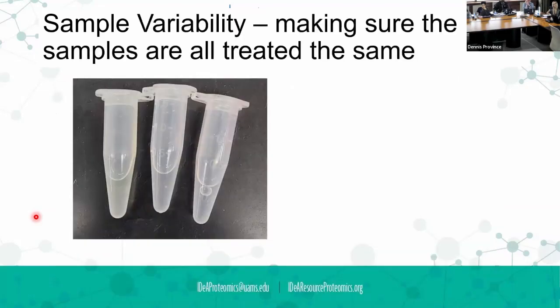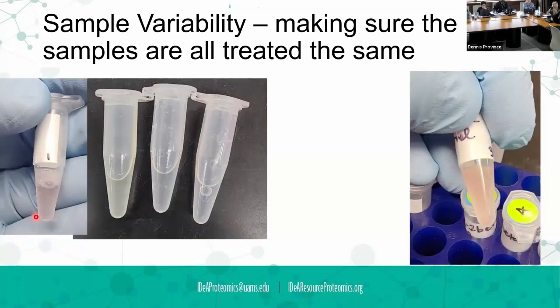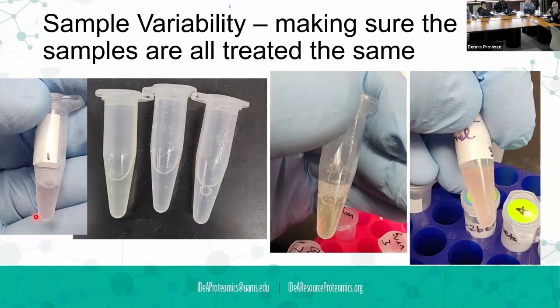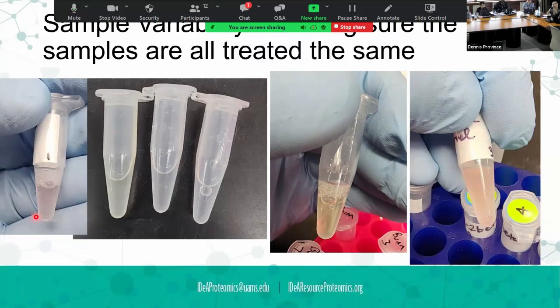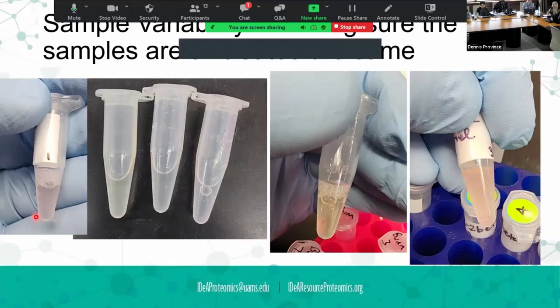Okay, we're almost done here, and then we're going to kick it over to Stephanie. So, sample variability. We want to make sure all the samples are treated the same. Now, Robert's got much better eyes than I do. When he looks at these up here, he looks over the one on the far left and goes, that one's kind of got a yellowish tint to it compared to the other ones, right? But then one of the samples looks like this, and one of them looks like that. And this is all in the same sample group, right? I'm not trying to pick on anybody, and I know you guys have experimental challenges in your lab. But if you can see the variability with your own eyes before you even start the sample prep, you know that we're going to have some in-group variability from that.